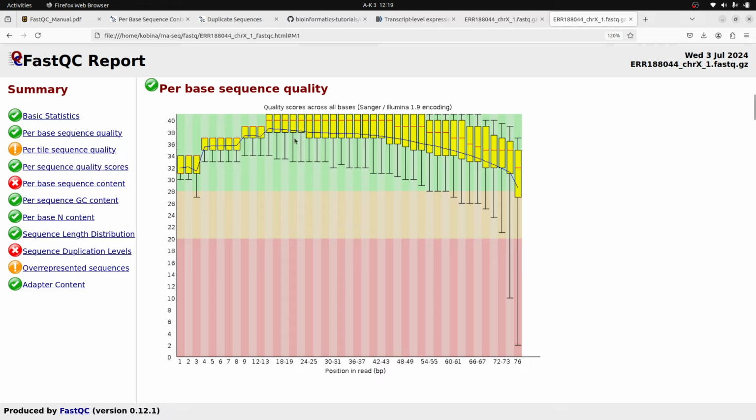Also, that one to the quality, we have good scores. So that's why we see them. We see the green color and we also see the check symbol. And you can see all of them in the green region, indicating high scores. All right. When we come here, it tries to deteriorate a bit. This is also something to be expected when dealing with Illumina reads.